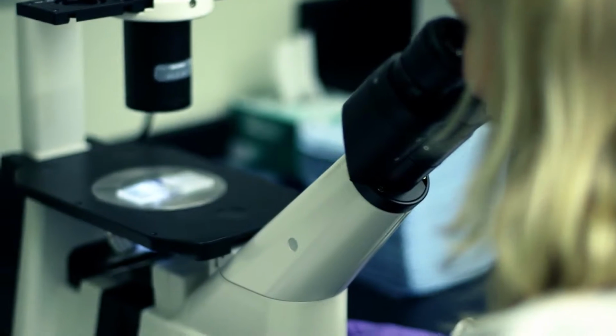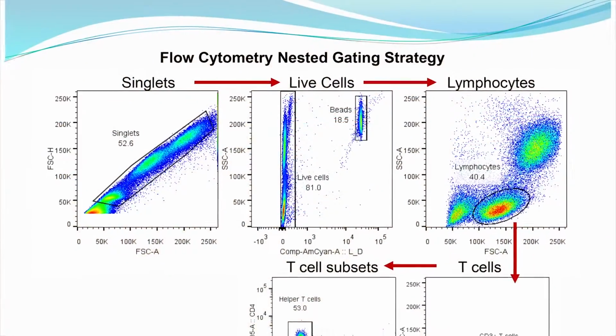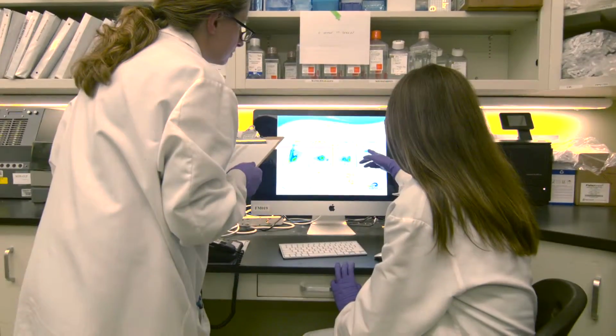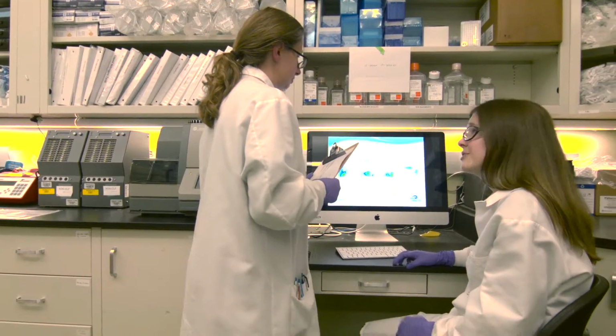The core principles of flow cytometry begin with monoclonal antibodies, which allow scientists to know that they're going to measure one particular aspect of a cell, and fluorescent probes that bind to these monoclonal antibodies. When you shoot these fluorescent probes with light, they'll fluoresce, so you will know quantifiably how much of a particular antigen was present. You can measure one particular aspect of a cell on many, many cells, or, the more sophisticated the cytometer you have, you can start measuring more and more different aspects of these cells.